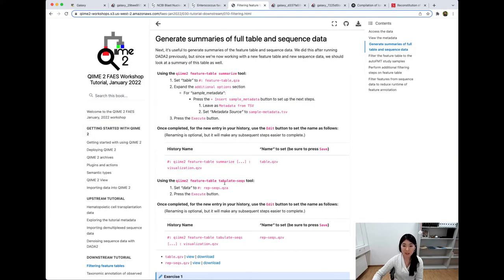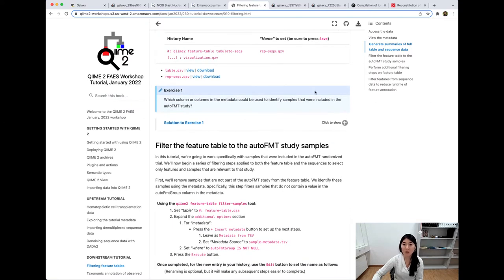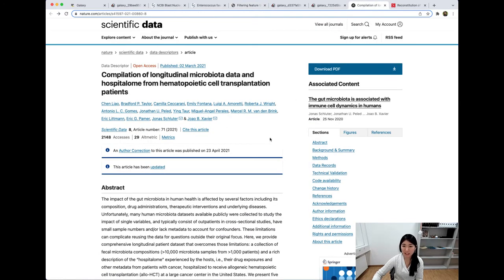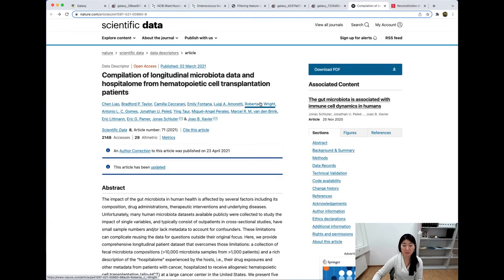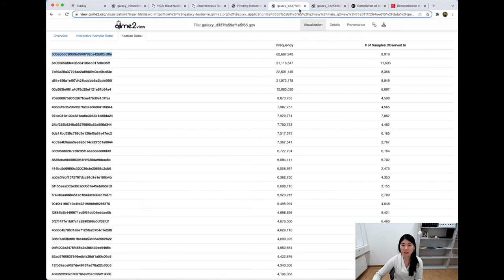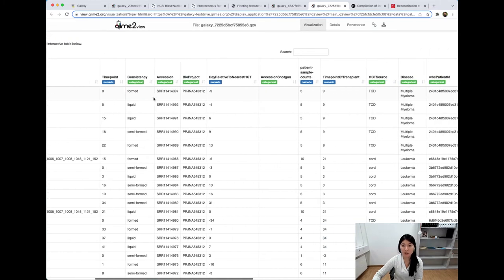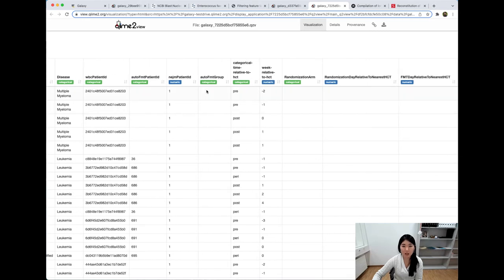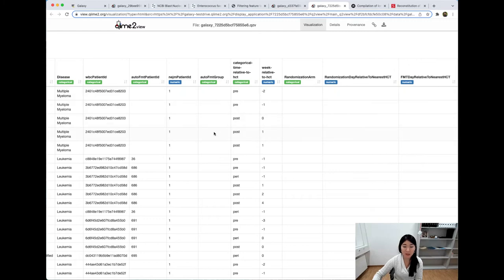Next, after summarizing our feature table and representative sequences, we want to filter the feature table to the auto FMT study samples. We started off with data from a larger study that actually contains data from multiple different studies, including the auto FMT study we're interested in. To figure out which samples belong to it, let's go back to our metadata tab. We see there is a column called auto FMT group. Most entries for this column are blank, meaning they're coded as null. But when we sort this, we see a number of samples coded as 'treatment' within auto FMT group, meaning those patients were part of the auto FMT study and received treatments.